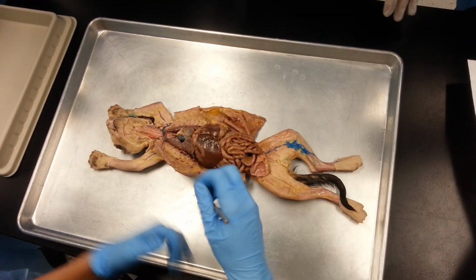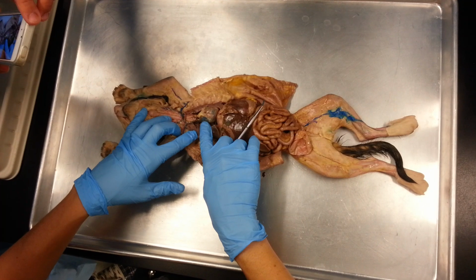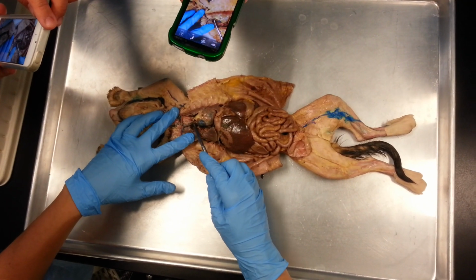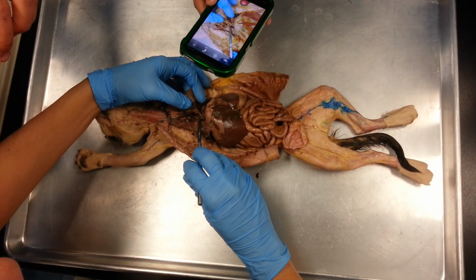Okay, so we usually start at the heart. We can start with the easiest chamber to identify, which is the right atrium. This blue chamber is the right atrium. Coming directly up from the right atrium, we've got our superior vena cava. Down the back of the heart, through the lungs, we can see our inferior vena cava.